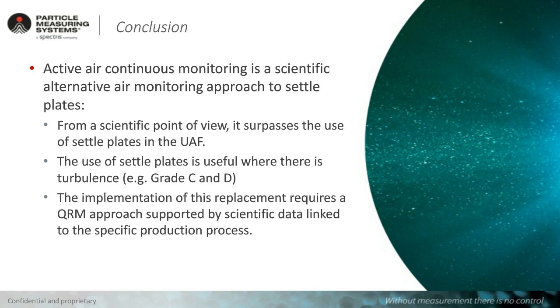We know that the use of settle plates is very useful where there are turbulences, less airflow, etc. So still in grade C and D, we have very valuable data telling us what's happening in these gowning areas, for example. But in critical areas, the data generated by settle plates is really questionable and not validatable, and especially it is not actionable data because you simply cannot trust what is coming out.